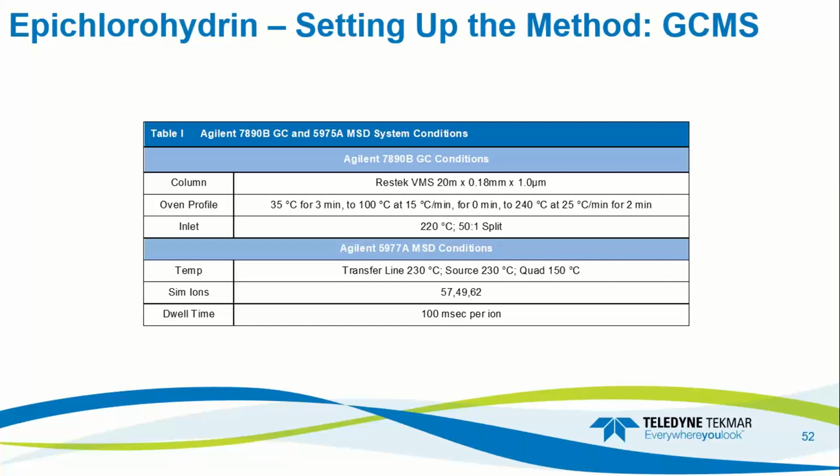So we have to be able to verify this compound at such low levels. Here we need to utilize SIM mode on the mass spec to significantly increase our sensitivity.